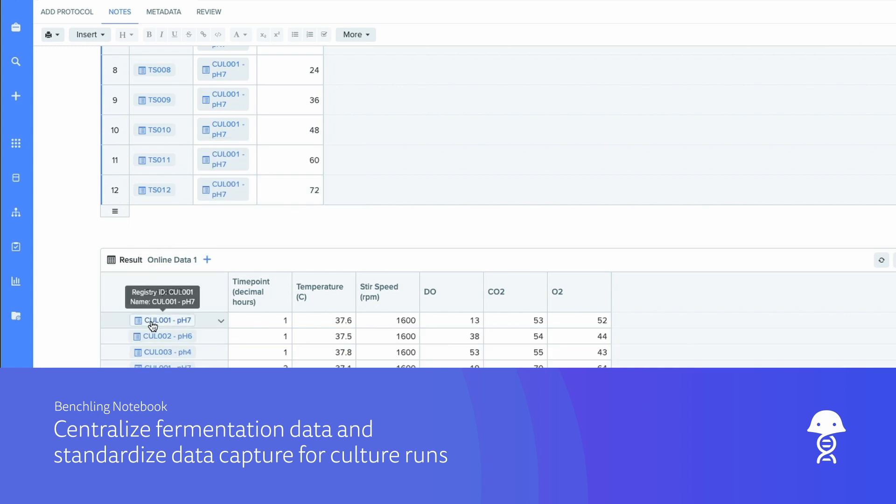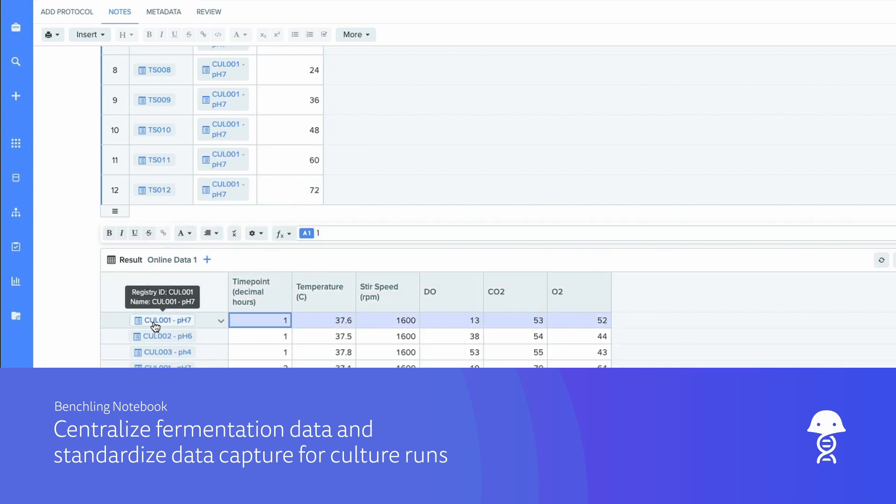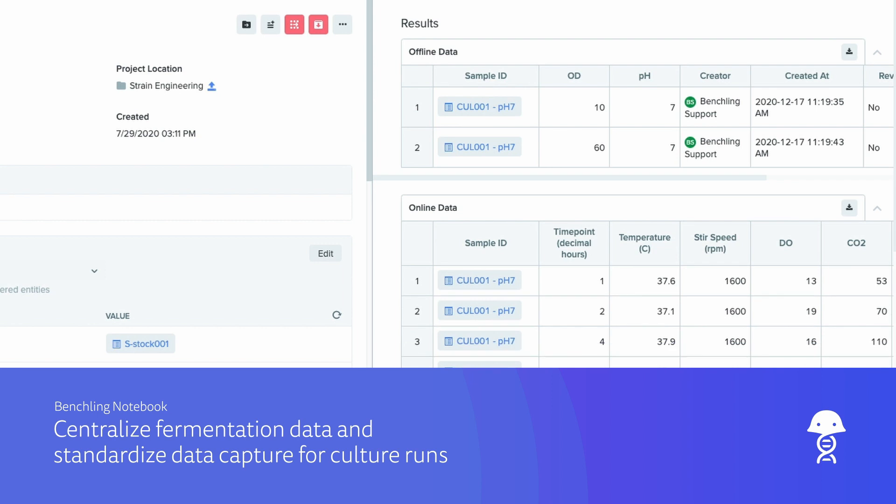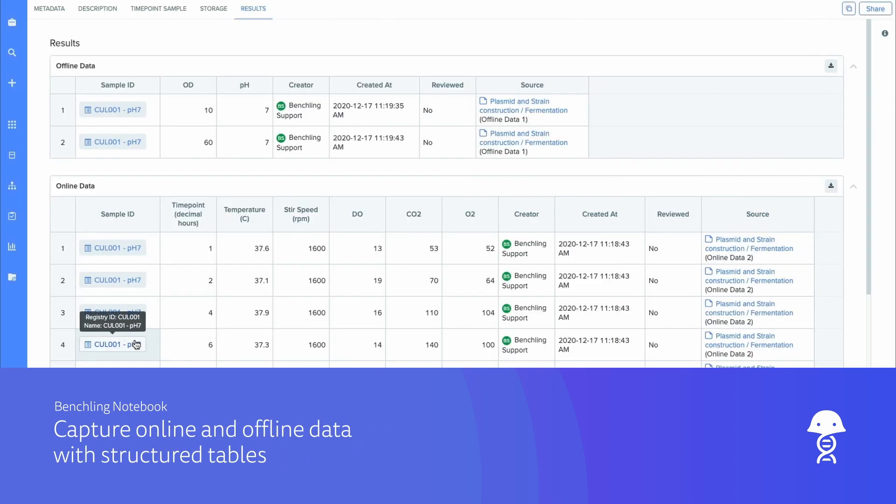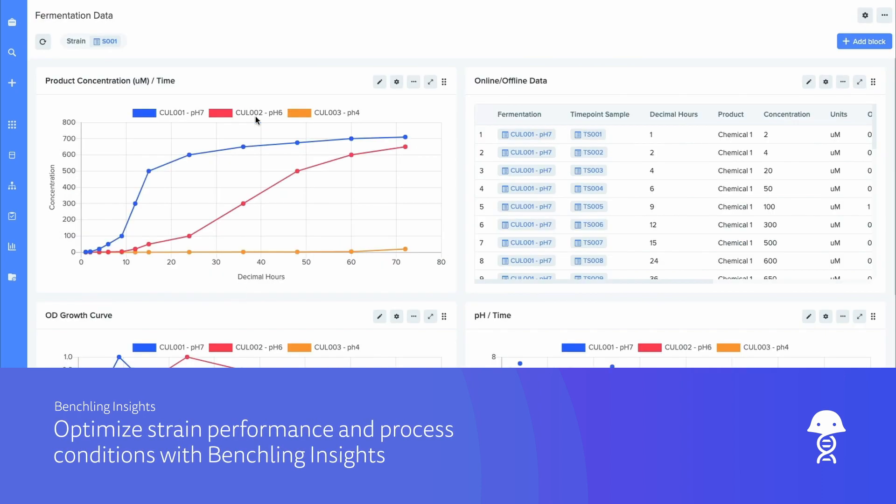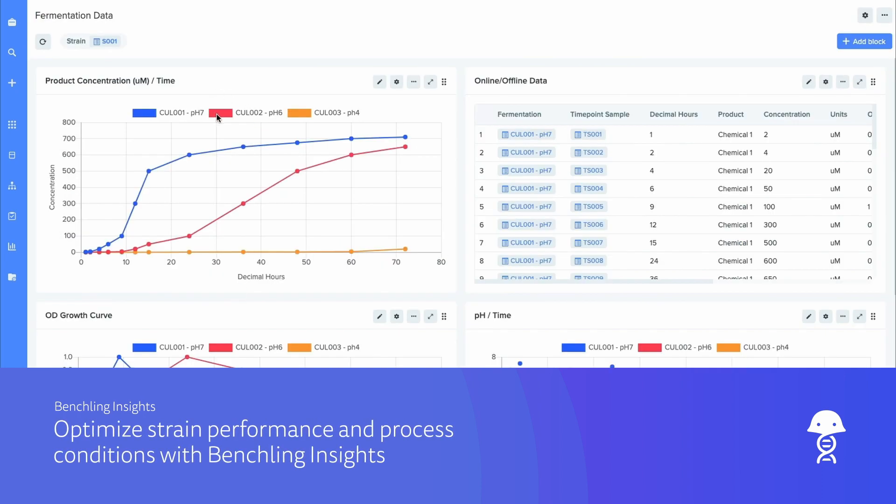Create standardized templates for culture runs with varying conditions. Structure all of your data, both online and offline. And visualize, examine, and optimize strain performance and process conditions with reporting and analytics.